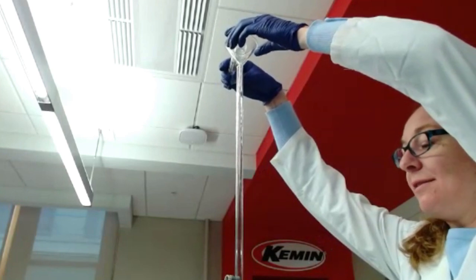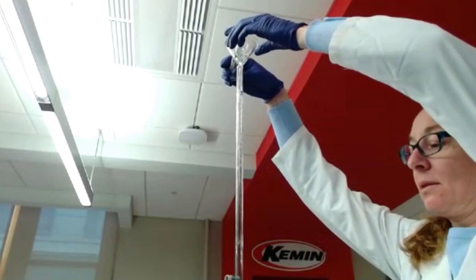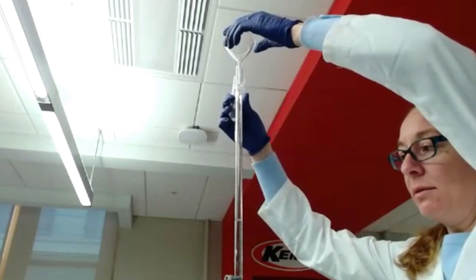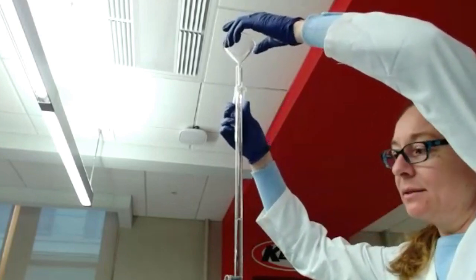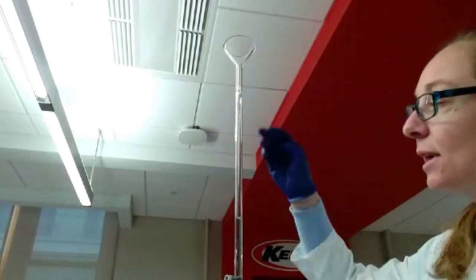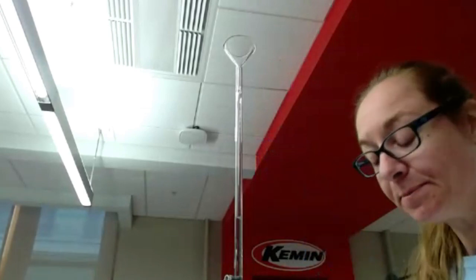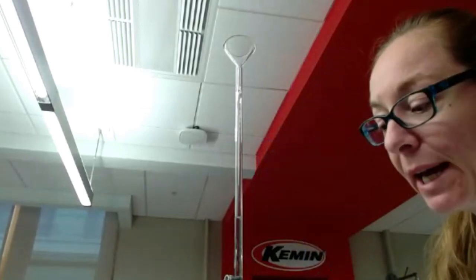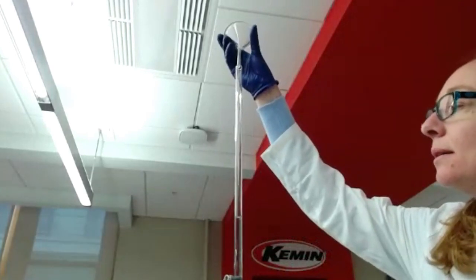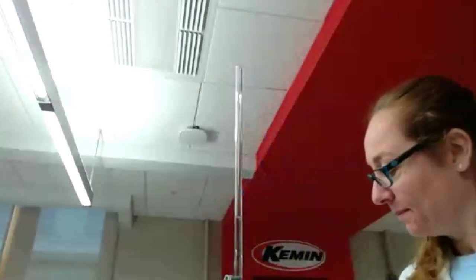Once again, make sure the tap is closed. I won't put everything, because I don't need everything today. If you know that you have a lot of different analyses to do, you can fill in the entire burette. That way you won't have to refill that many times. But for today, because that's only one measurement, we're just going to use a little bit of it.